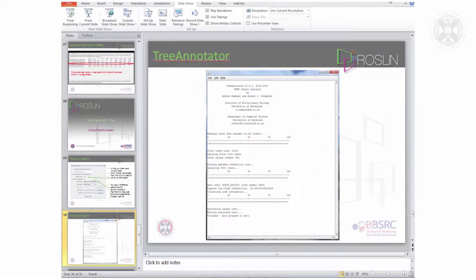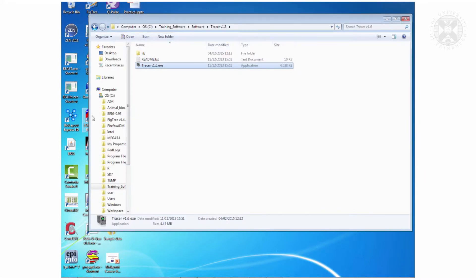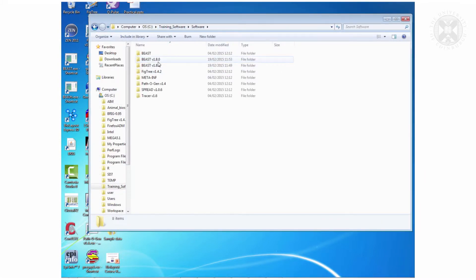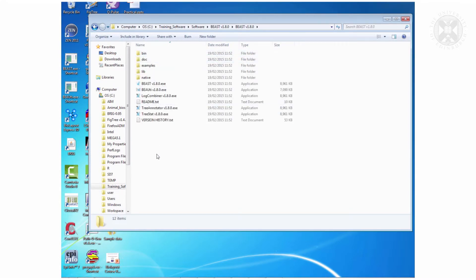Let me just show you where Tree Annotator is. Tree Annotator is in training software, Beast 180, and then it's this one here — Tree Annotator.